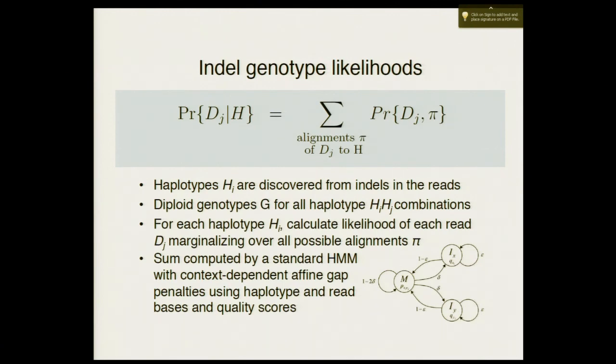Now indels are a little bit harder because first of all, you cannot list a priori all of the possible indels that you have. So the approach that we take in UnifiedGenotyper is that we only consider the alleles which might be present in the reads and that the aligner put in. So for example, by default at the Broad, we use BWA. So if BWA actually opened a gap at a particular location, we will consider that for the indel discovery.